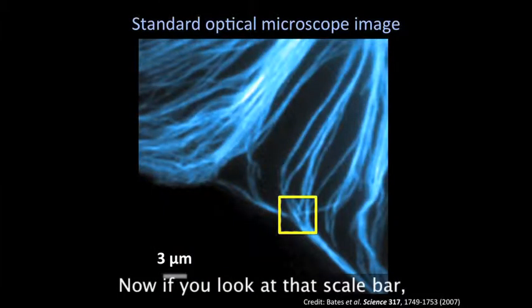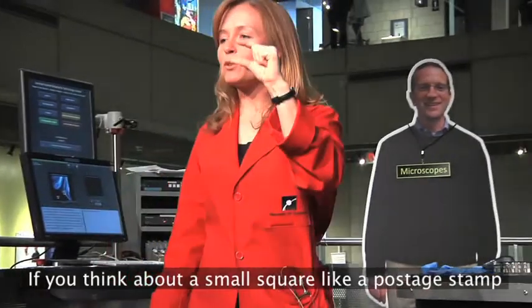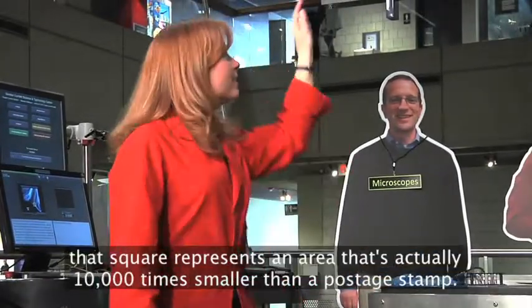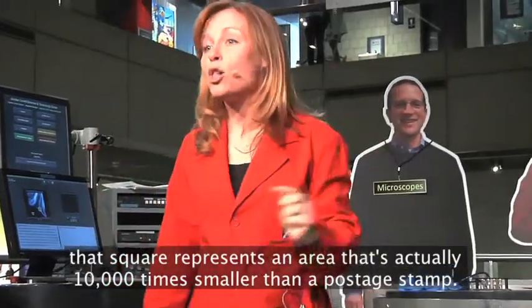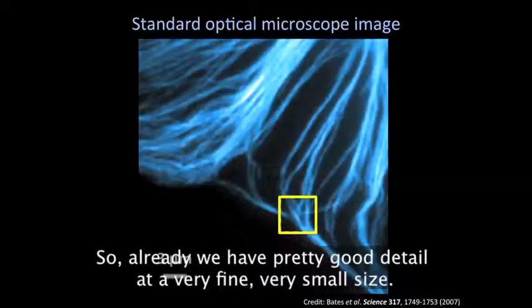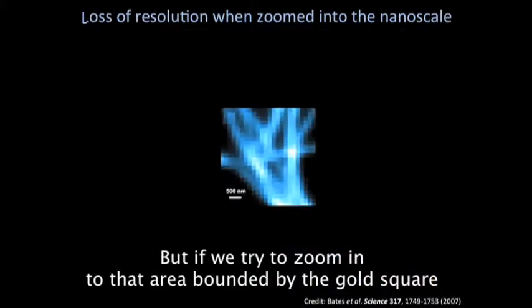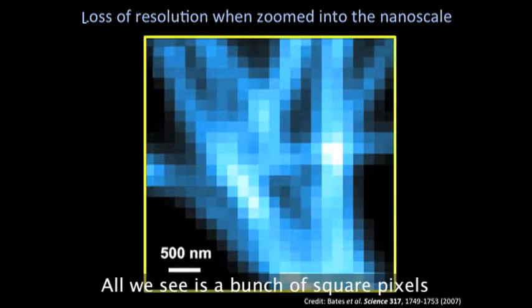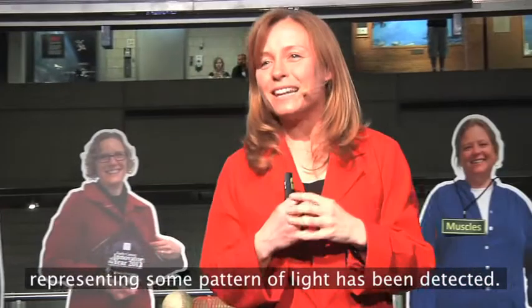Now, if you look at that scale bar, you see that the gold square is about 3 microns in size. If you think about a small square like a postage stamp, that square represents an area that's actually 10,000 times smaller than a postage stamp. So already we have pretty good detail at a very fine, very small size. But if we try to zoom in to that area bounded by that gold square, all we see is a bunch of square pixels representing some pattern of light that has been detected.